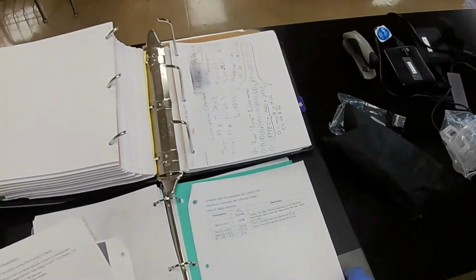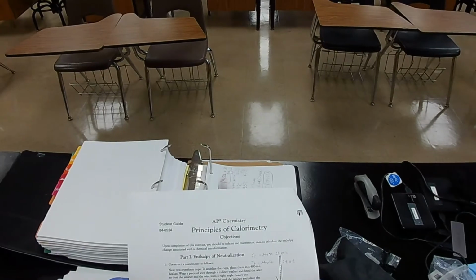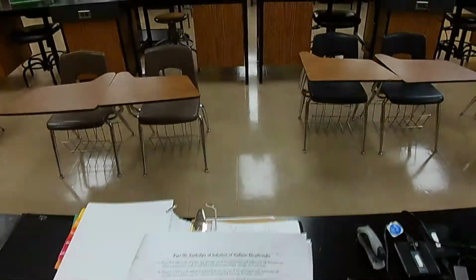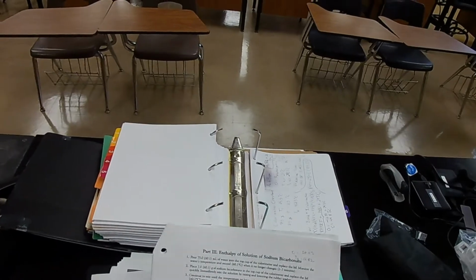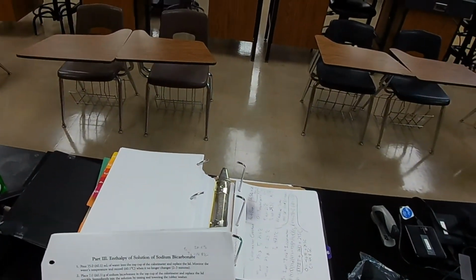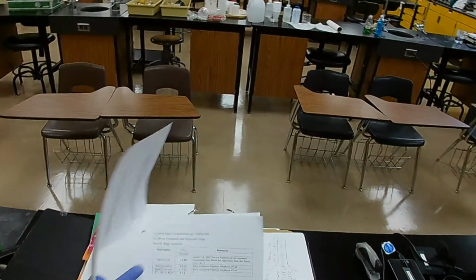And all I'm going to do now is just take another look at the document. No, there's not. There are laboratory questions. All right? Laboratory questions. Calculate the enthalpy of neutralization from your calorimeter data in part 1. You've done that, but it asks you questions. Is your value the same as the true value? What's the true value? Well, it's not the true value. It's the accepted value, which is in this table.